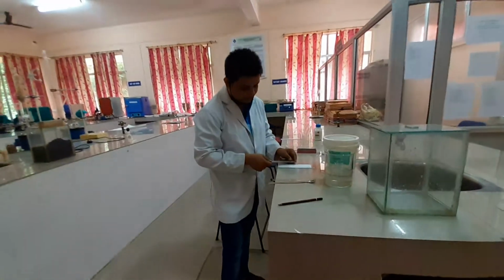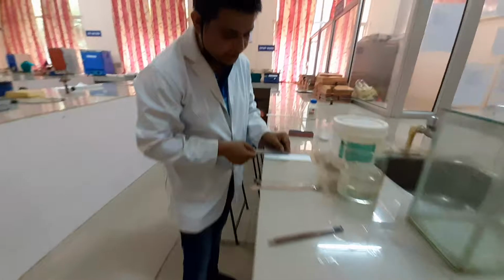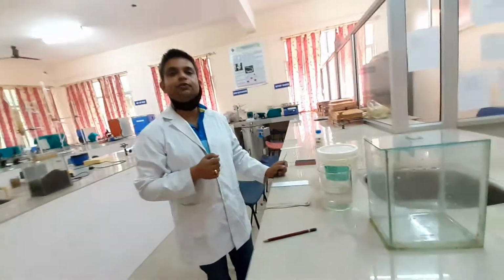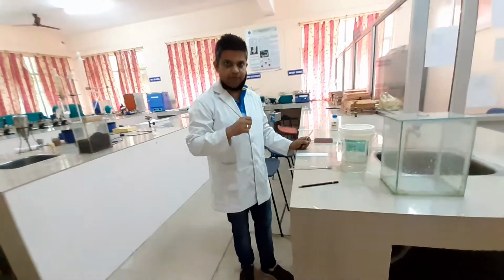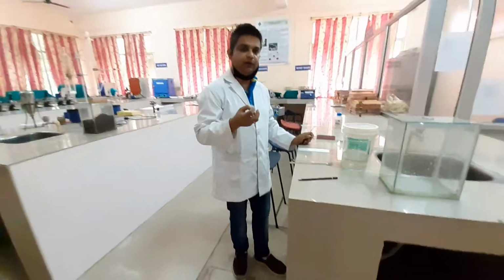Now we are going to measure how much the spot has travelled. Let us imagine it travels approximately 5.9 centimeter. So 5.9 divided by 10 is equal to 0.59. So it is the standard Rf value of this compound we have taken. So the Rf value of valine is 0.59.